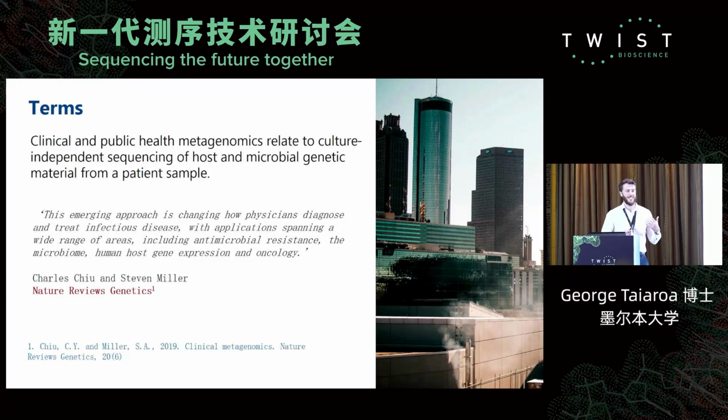But as things are increasing in pace and we need to have answers really quickly in the context of public health and even in clinical microbiology, having culture-independent methods that we don't need to use culture for is becoming really, really important. You might have heard this described as metagenomics, another phrase that represents sequencing everything in a sample rather than growing something out of the sample and sequencing it on its own.